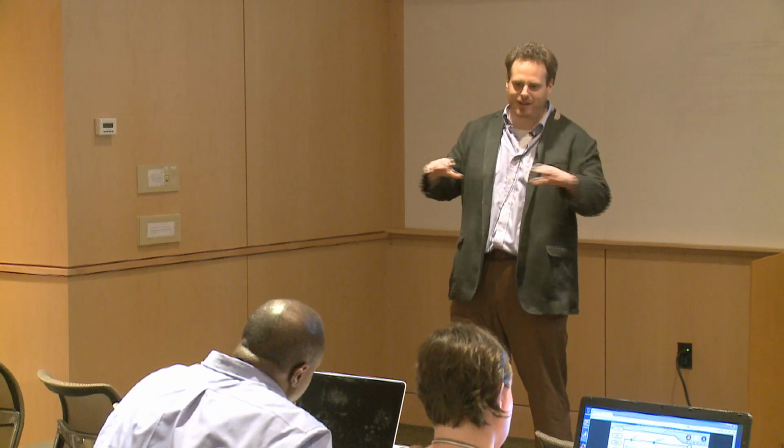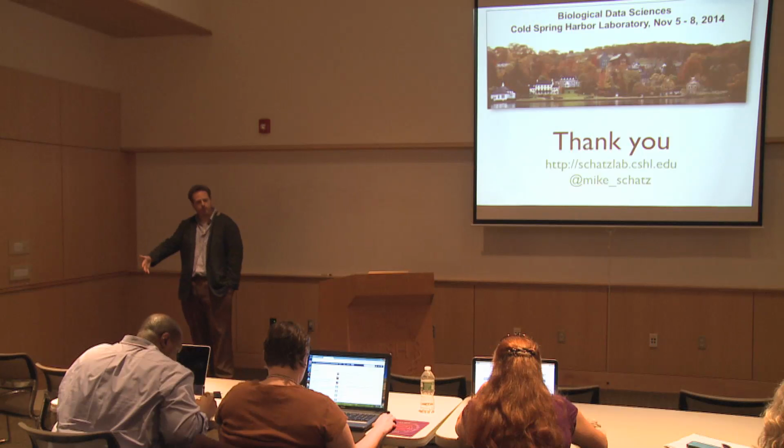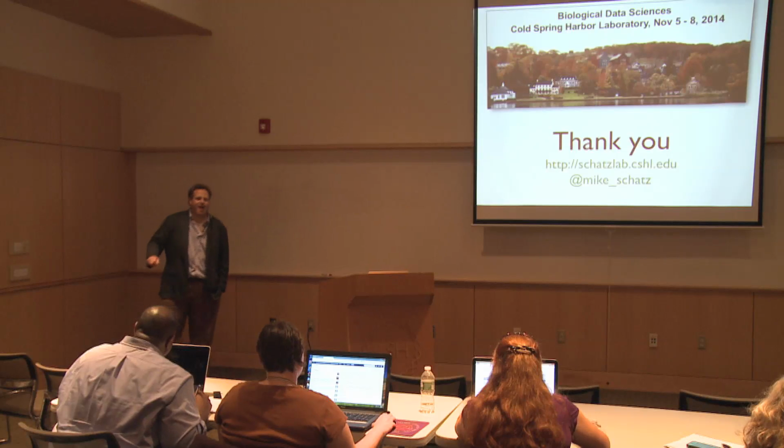Once you have even a rough draft of a sequence, you can go back and map your Illumina data to it to polish it up. That's quite practical at below 10x coverage of, say, PacBio reads. From 10x coverage to about 50x coverage, the right thing to do is call me, because my lab has an algorithm that any day now will be submitted for publication.